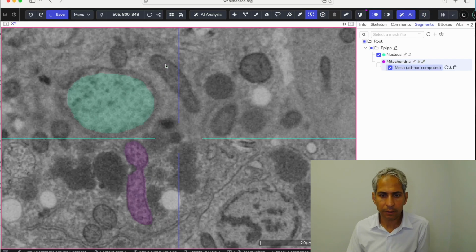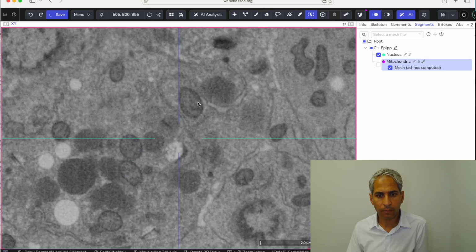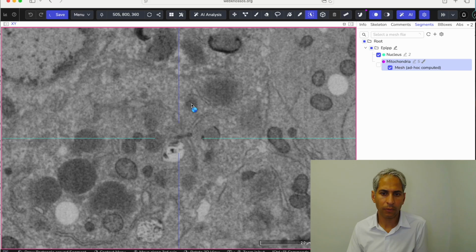Now you can see that, yeah, that did a good job. Do this one too. This one. The very tip of it.